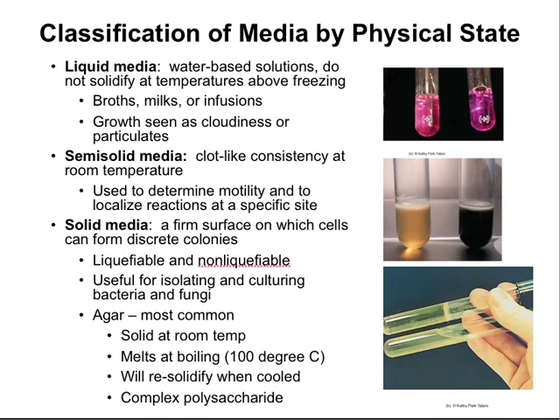Let's begin by looking at media in the physical state. Again, we have liquid, semi-solid, or solid media. The liquid media are water-based solutions. They are literally solutes that are dissolved in distilled water. They don't solidify at temperatures above freezing, and they're considered things like broths, milks, or infusion. When we see growth in them, they appear cloudy, or they have particulates, and sometimes they have a little scum on the top.